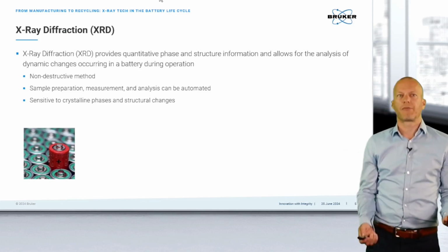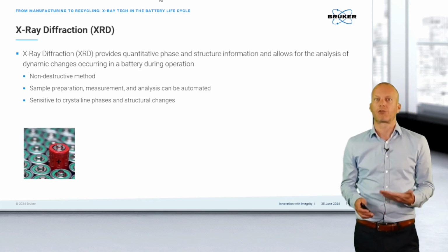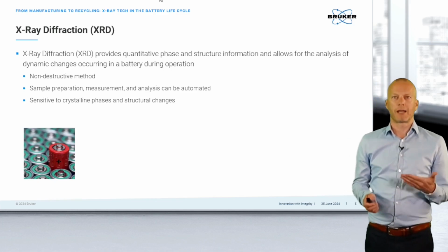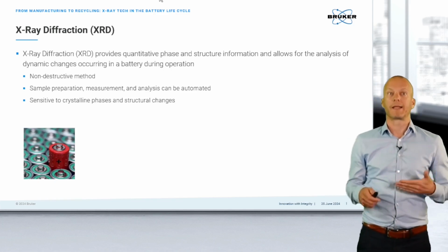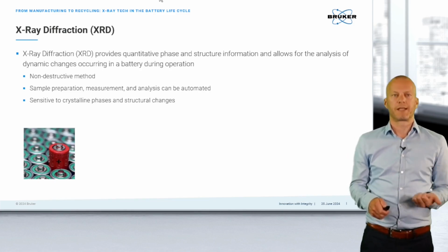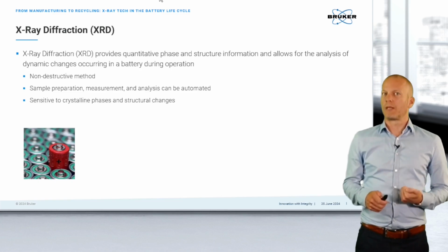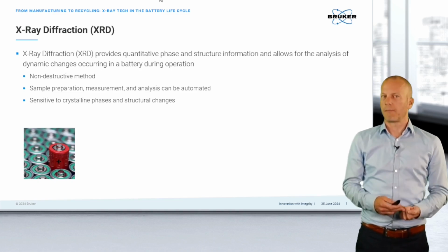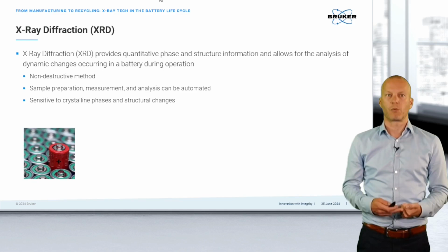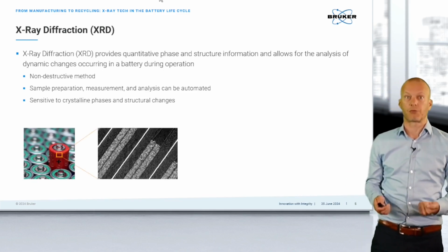So what is X-ray diffraction? Well, it's an analytical technique that provides quantitative phase and structural information, and it allows for analyzing dynamic changes that occur within a battery during its operation. Nice thing about it, it's a non-destructive method. Sample preparation, measurement, analysis, all of these can be automated in certain situations. And we are sensitive to the crystalline phases and structural changes.